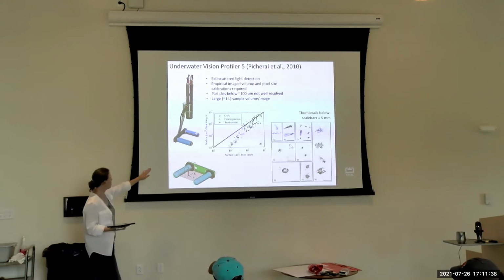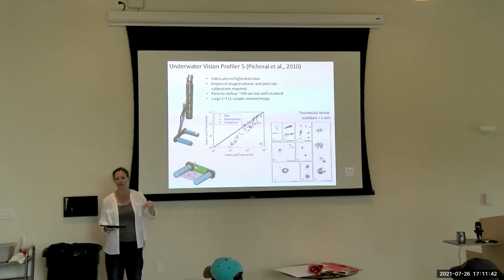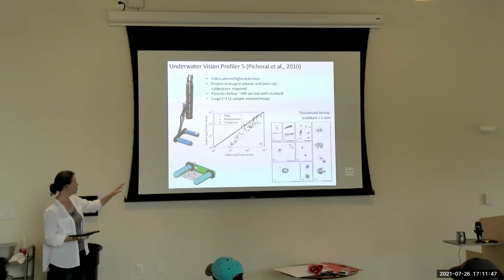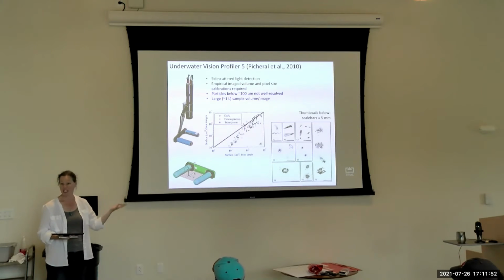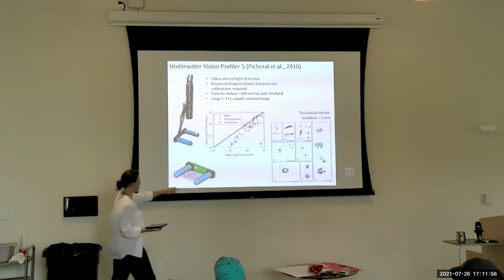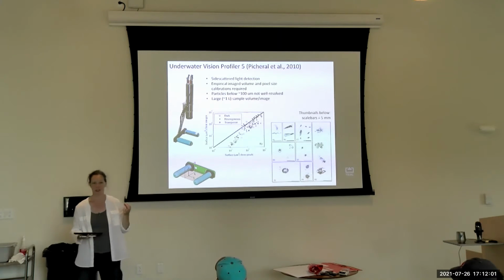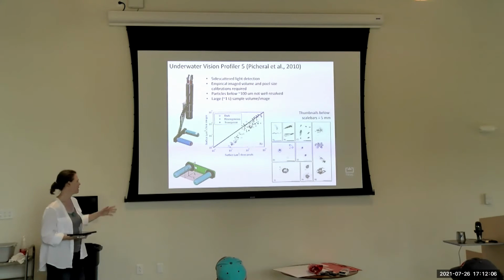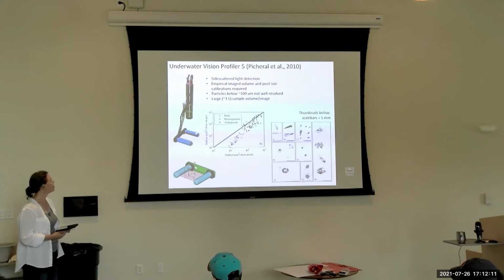We're looking not at the light that's passing through the sample in this case, but at the light that's scattering off to the side. When you look at images from the UVP, there are some examples over here in the lower right, typically they're inverted, so it looks like a bright field. It's got a white background and dark pixels, but actually you're looking at light that's scattering off of the particles. It's actually red light, but that might be more like what the camera is actually seeing.